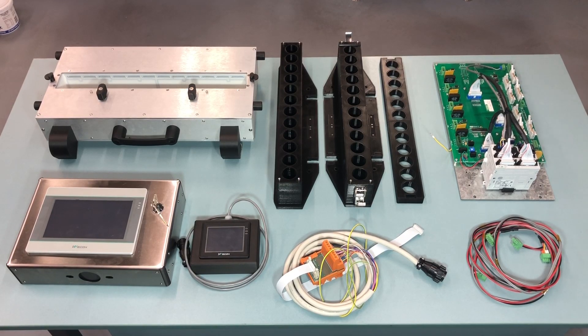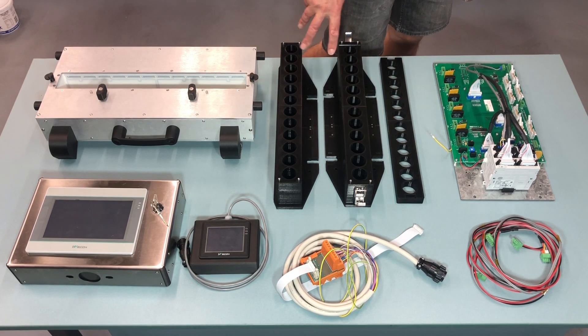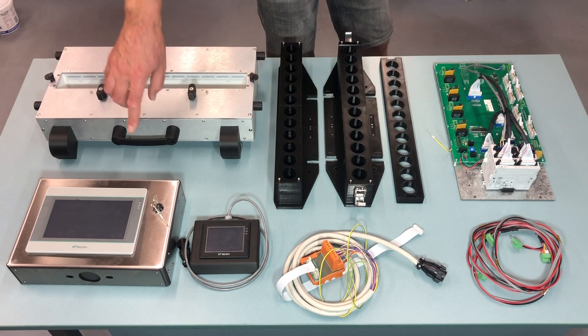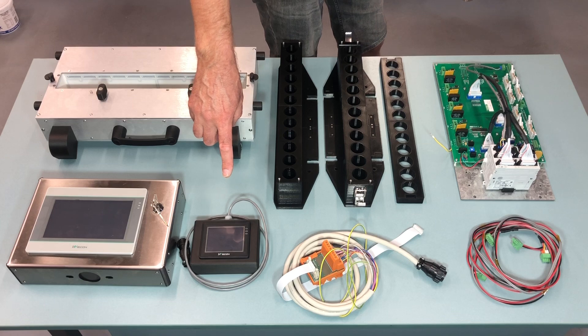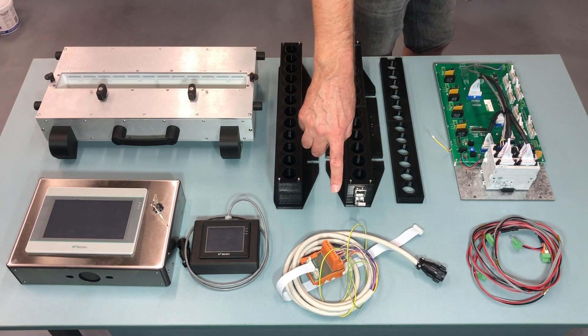These are the items that you will be receiving: the new counting head, the new tablet guides, the new controller, the new HMI, the QA terminal to test the counting head, and the counting head cable.